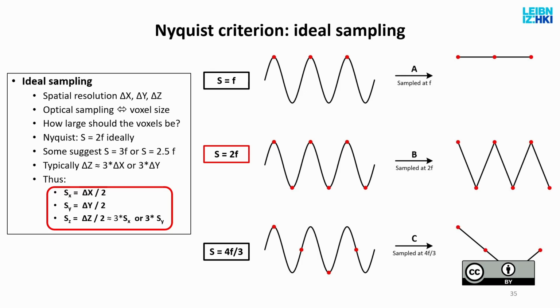Now, this is fine. This tells us how close these objects can be so that we see them separately. But then the question is, what resolution should the image itself have? That is, how detailed the image should be that I take of this object. Rumen will talk to you about pixels and pixel sizes, but for now it's enough to say that when you generate an image and when you look at it on your computer screen, you will look at it in a digital format where the image is made of image points, so-called pixels.